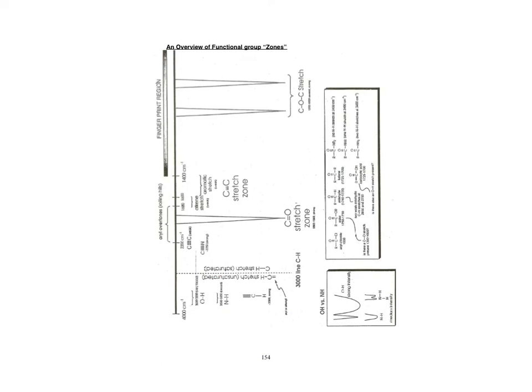So here's another overview of the functional group zones. See if I can turn this around. Turn it this way, there we go. So you can have, look at the ones we've already assigned, the CO stretch zone.